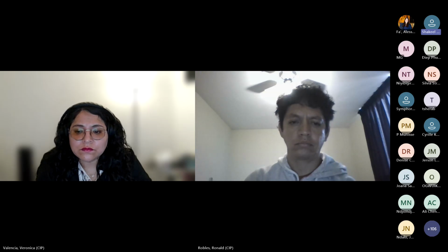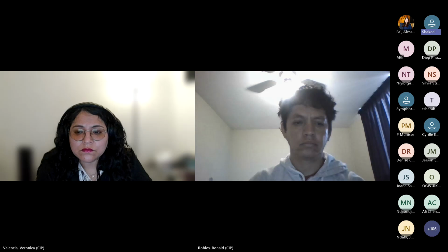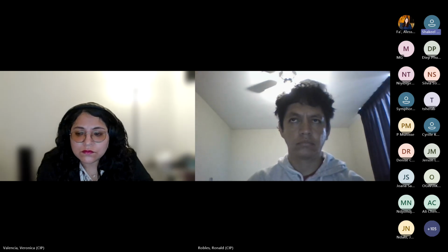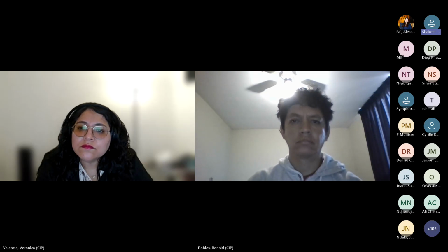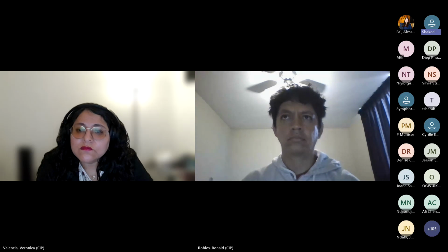So the first question is: is there any optimum ratio, or is there any effect on the DNA integrity if we are using a high amount of liquid nitrogen for grinding, or we are grinding our tissues for a long time using liquid nitrogen? What will be the effect on the DNA integrity? Can I go for the second question, or after the answering of this question, can I ask the second question?